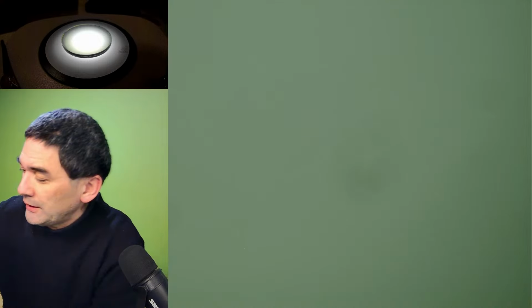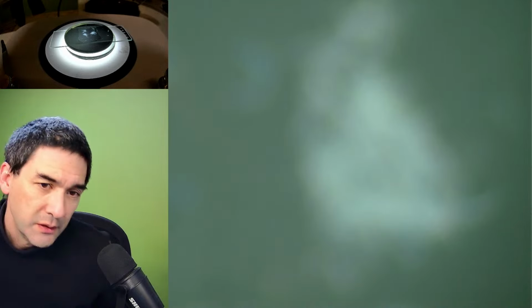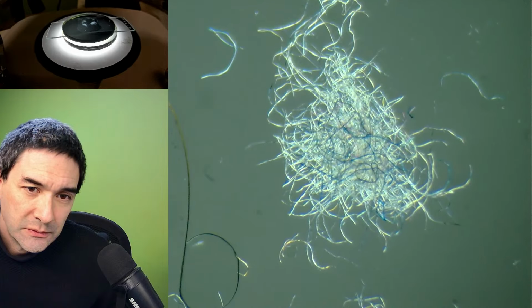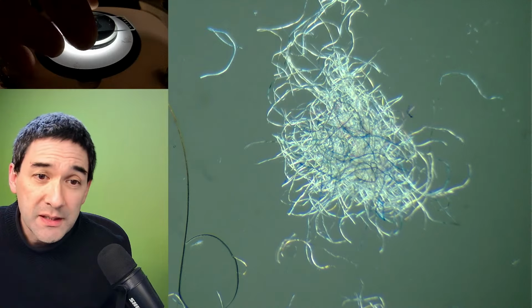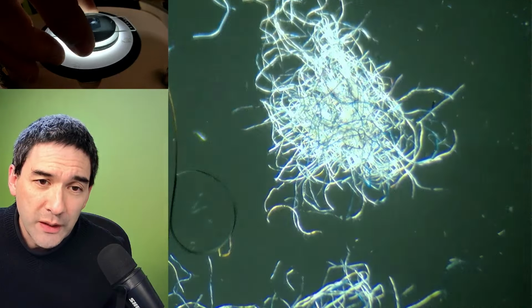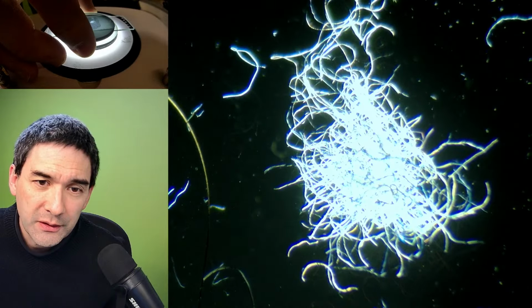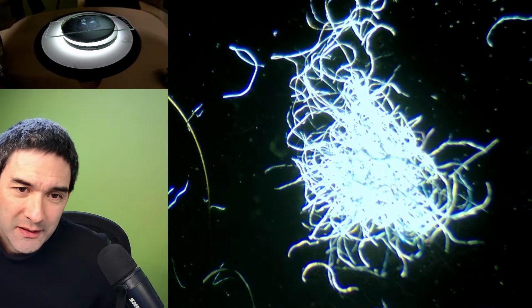I'm just going to drop the fibers here on top. This one goes across like this here. I have to refocus again and put the microphone a little bit closer. It's a little bit the cheap way of doing it right now, because I simply dropped the filter directly on the slide. This is how it looks.